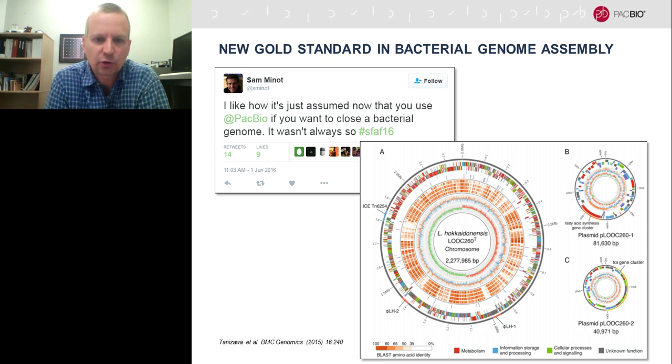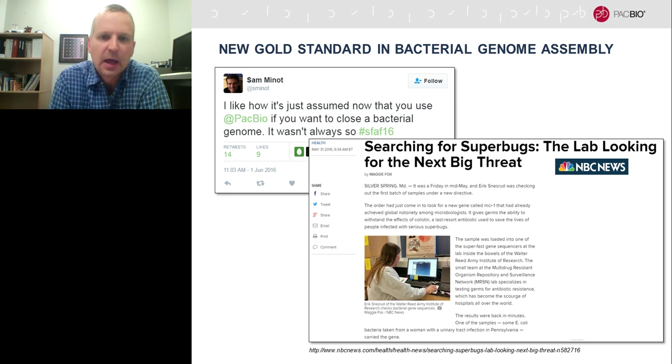Not only getting the bacterial chromosome that you see on the left here, but significantly also resolving to completion and closing the plasmids, the mobile genetic elements that are in many cases so important in understanding the biology and understanding the pathogenicity of the bacteria. And so this has made its way into the mainstream media.